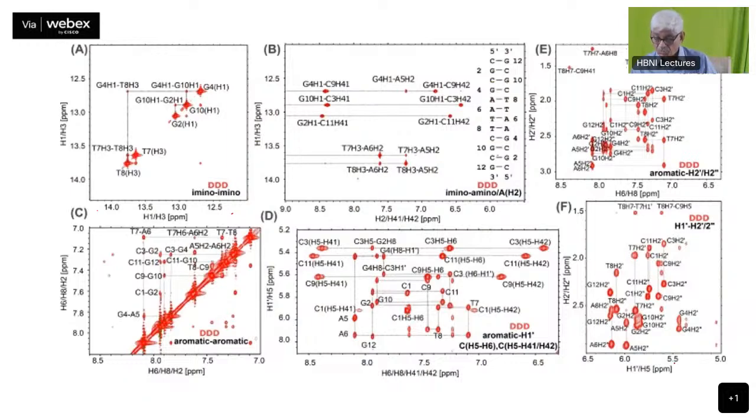So this is also proton distances here, 1 prime to 2 double prime, which I already showed you earlier. This is in the NOESY spectrum. This is the base to H2 prime, H2 double prime region, on the top portion of the whole spectrum which was indicated here. These are all individual assignments. And these are the imino protons to the base protons. Imino protons are here.